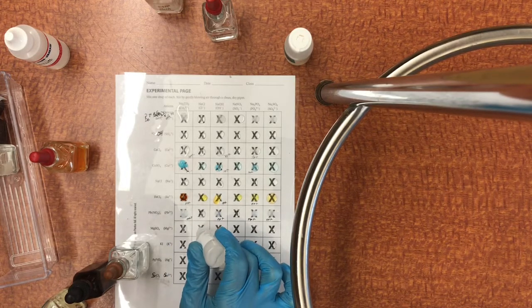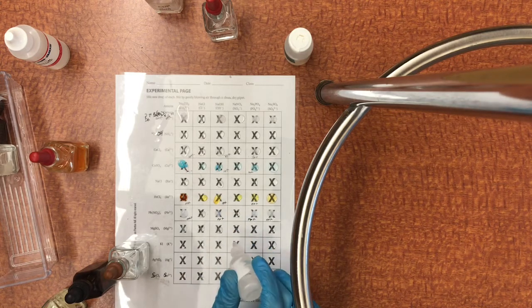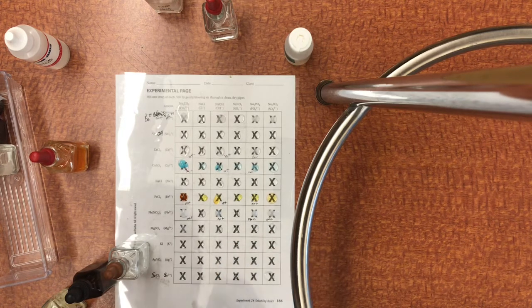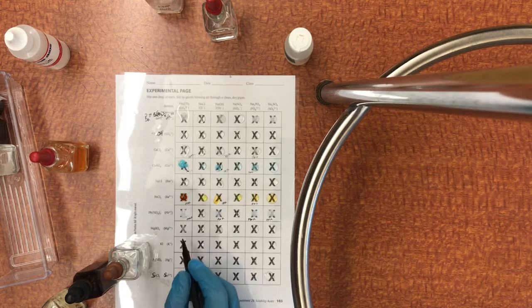A little bit of a reaction there. No reaction. Maybe a little bit of a reaction. No reaction. So the hydroxide does look like a slight reaction. Usually hydroxides are insoluble, and the carbonate is for sure.